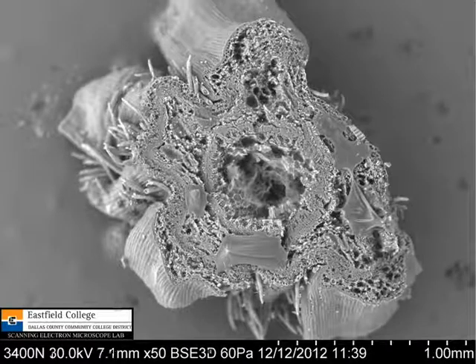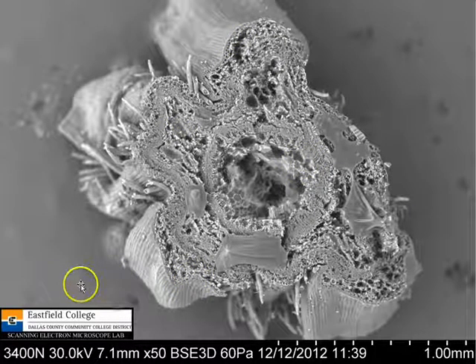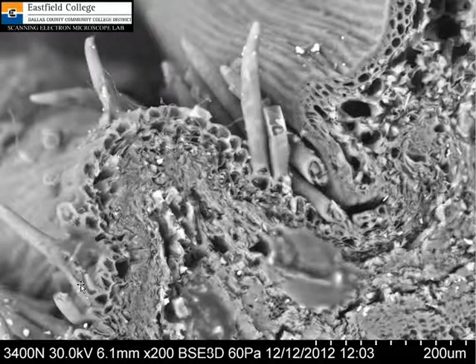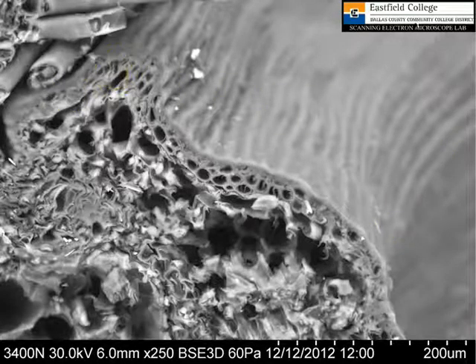Here's a cross section of the stem. And you can see I've cut right through again the pith here. You can see the xylem which conducts the water there, and then here you can see I've cut through the base of several leaves, and so you can see how the leaves attach. Here's a closer view of that, and then the last one here, and here the leaf goes off this way, and you can see some of the conductive tissue here.